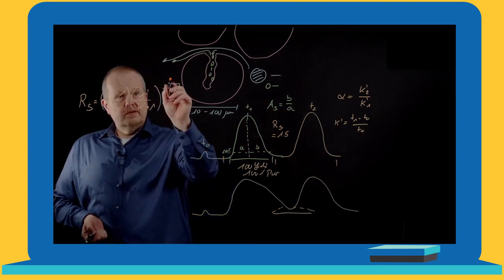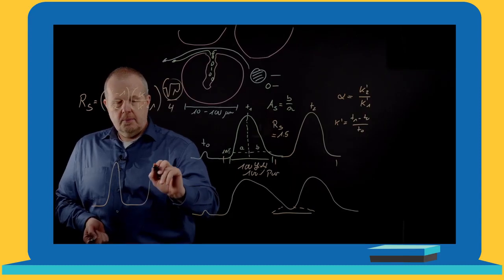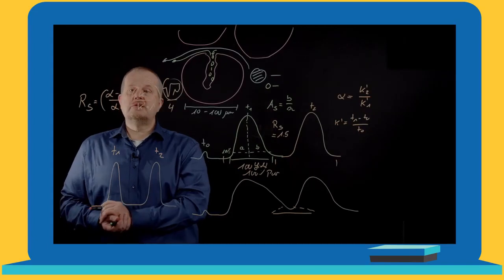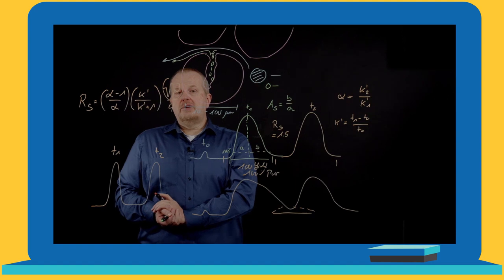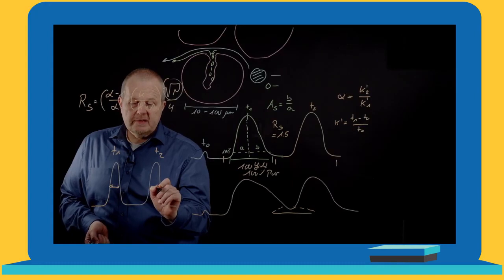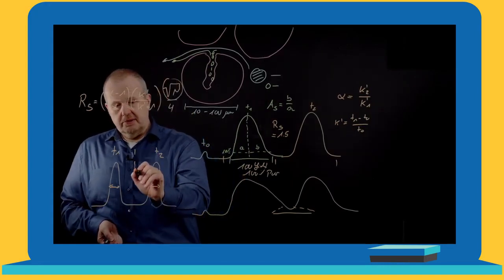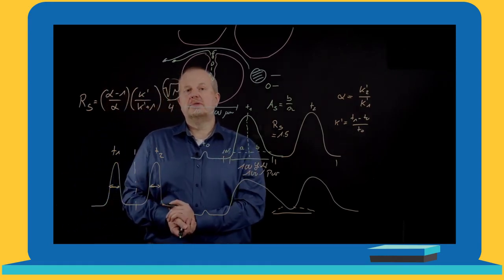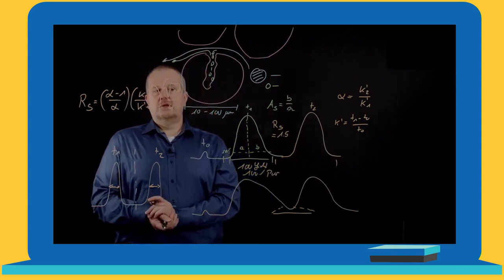If we optimize efficiency, it will end in two peaks which still have the same retention times. So our peaks appear at the same part in the chromatogram. The only thing which is different is that the peak width is narrower. And with that, we have now the possibility to separate both peaks again in 100% yield and 100% purity. So how do we optimize efficiency?